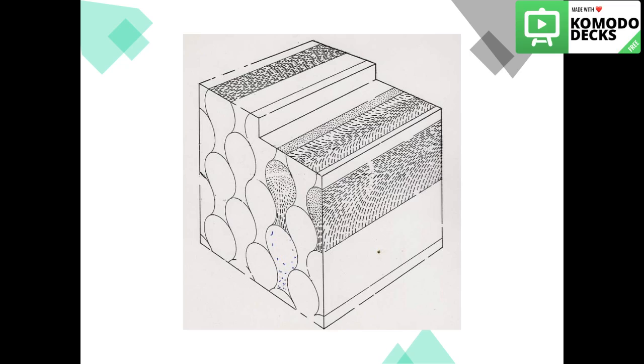Again, the crystals run in a horizontal path in the core and deviate in the peripheries and in the tail, which gives us the clear boundaries we will see in the next slide. As we can see here, these clear boundaries, more pink boundaries, are caused by this deviation in the crystal angles at the peripheries and in the tail.